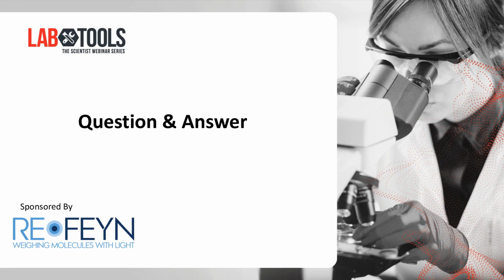We had a dimeric construct of the ACE2 ectodomain, but I don't see any reason why you couldn't truncate it, for example, to just the monomeric ACE2, particularly just where it binds with the spike. I don't see why those experiments couldn't be performed.